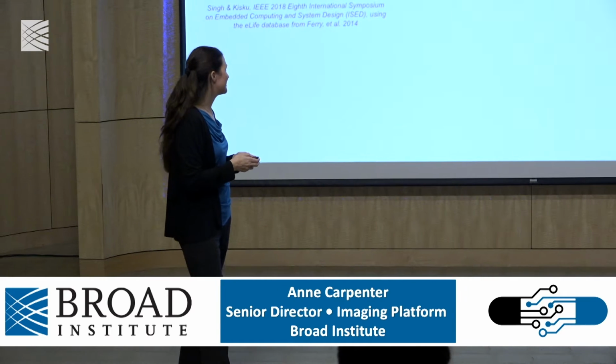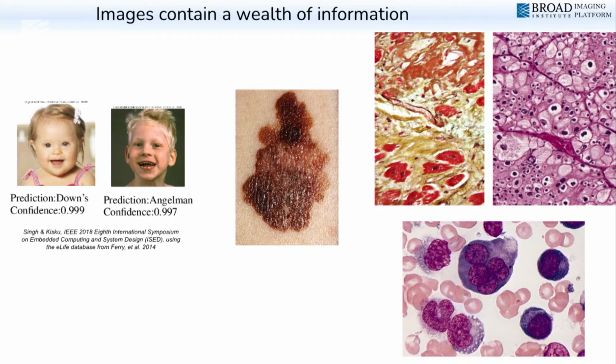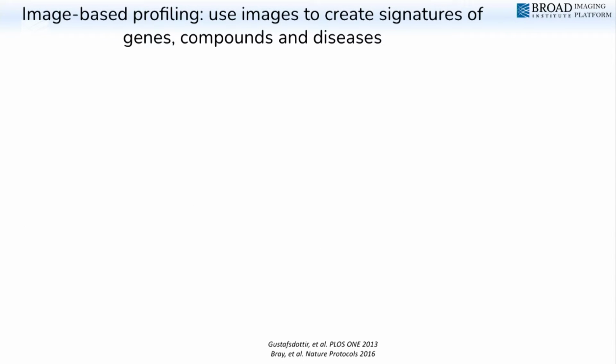Sometimes you can't look at a person's face and diagnose their disease. You actually need to dig a little deeper, and that might be zooming in, it might be taking blood samples, it might be looking more closely at their cell structures, but the fundamental concept is the same. There's something about the structure or morphology that is telling you what's going wrong with this disorder, and if we can make that kind of a diagnosis in a dish with cells growing away from the patient, we have a potential to screen drugs in order to potentially correct that disorder. So that's a basic concept.